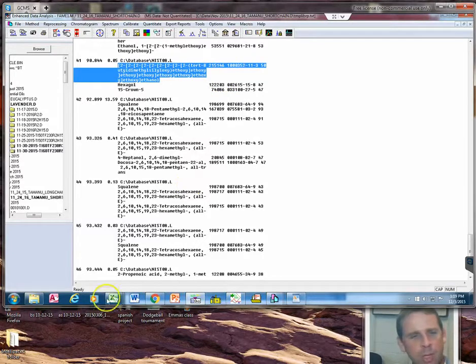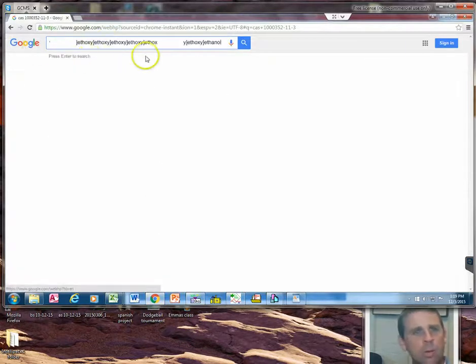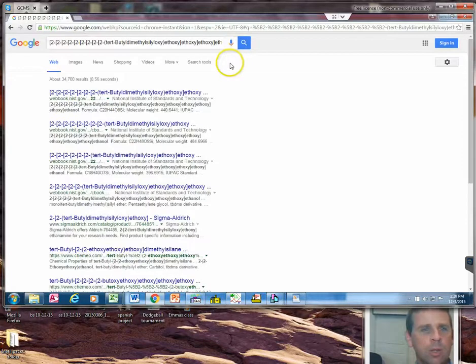So if we take that name and go to Google. Didn't paste very well. We also need to get rid of this number between. There we go. Let's see if we can find anything.